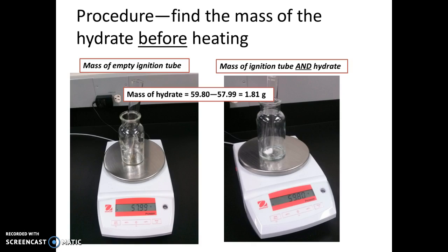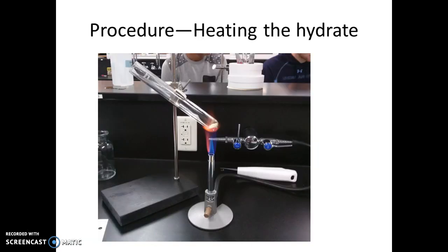Once you have that mass, you're ready to start heating your hydrate. And this is the setup we're going to use for heating the hydrate.